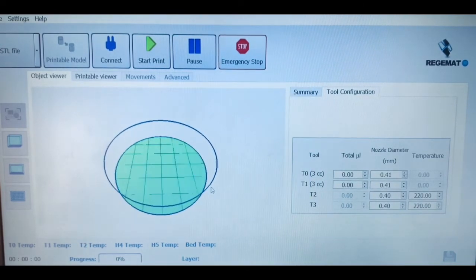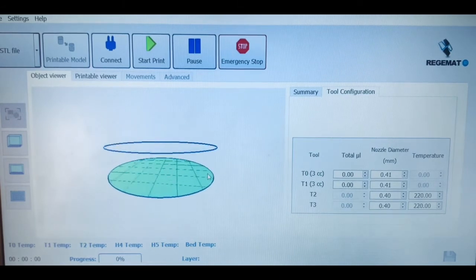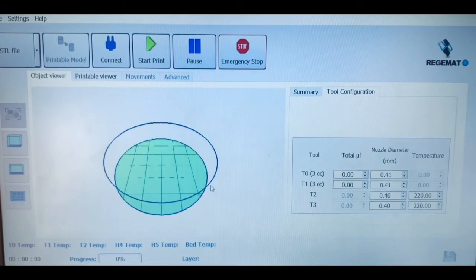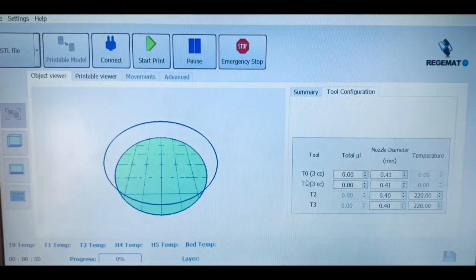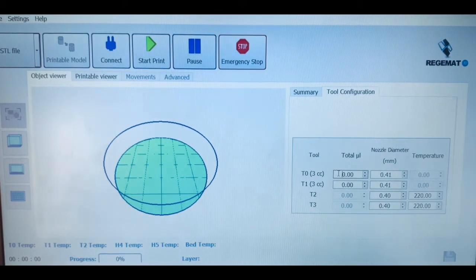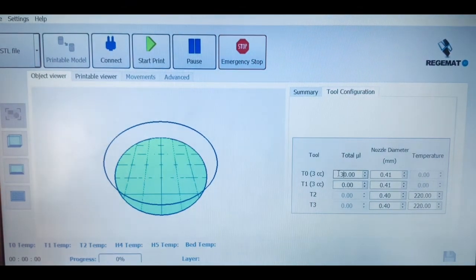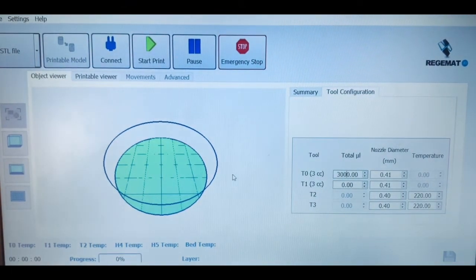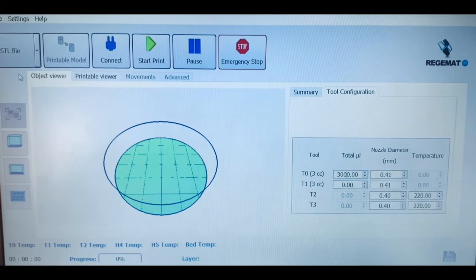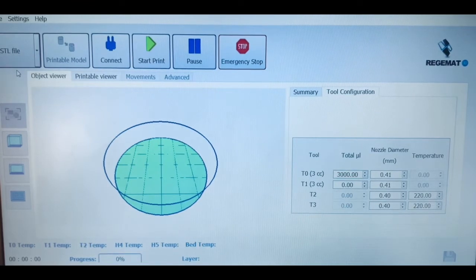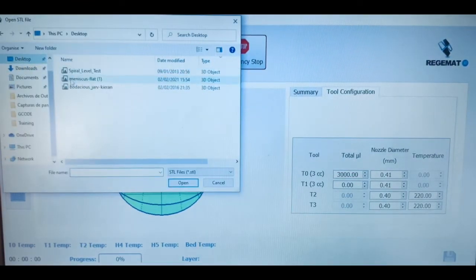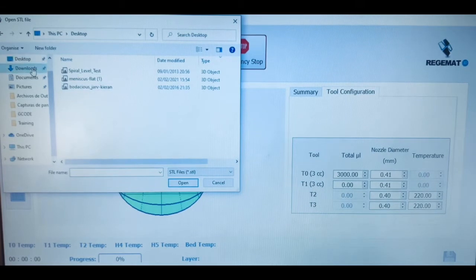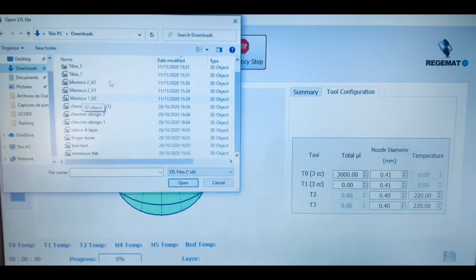This software also allows you to upload and successfully bioprint any kind of STL file you might find useful from an external source, one that you have designed yourself, or even launch the G-code published in a scientific paper. With the software, we also have the default STL files of cubic and cylinder structures.